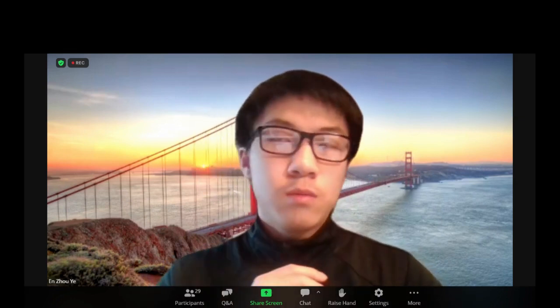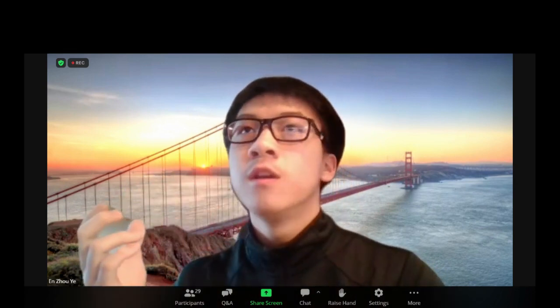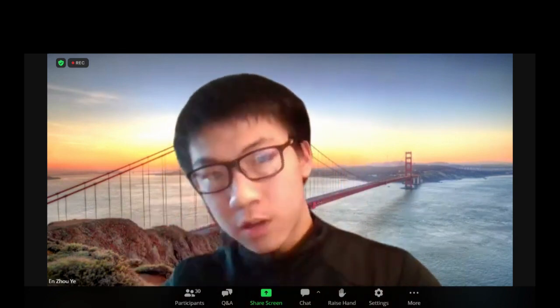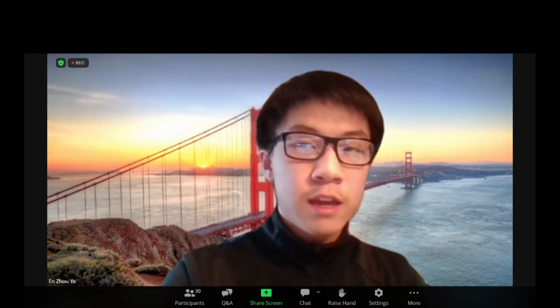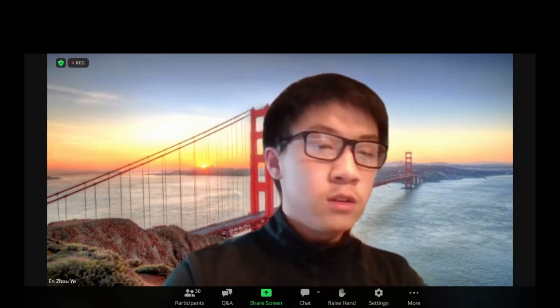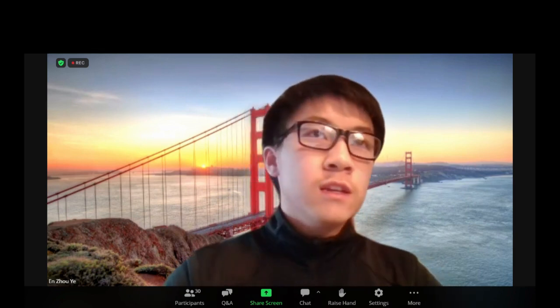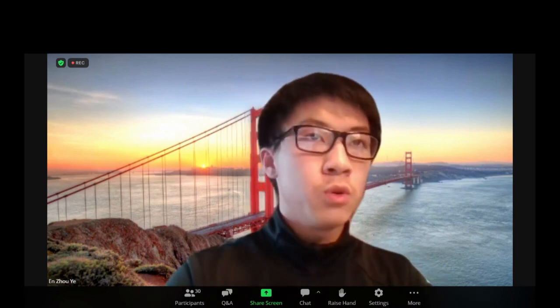This part of the research was based on, well, we have previously developed the Deep Image Translator. That's the name, and it's a deep learning software that can segment images using a model that can be trained using approximately 17 images. So we can use a lot fewer images to train a highly accurate model for image segmentation. And so this is basically just an update, an added function to our previous program.